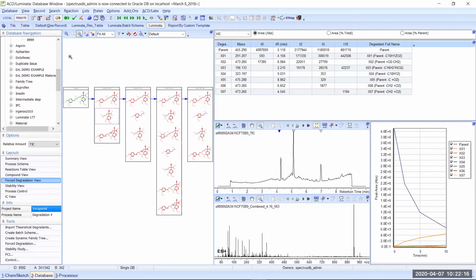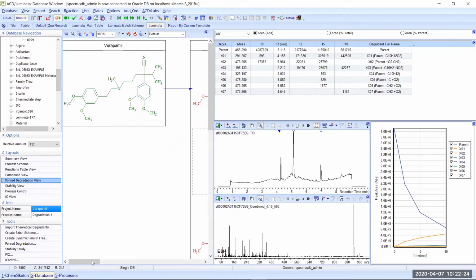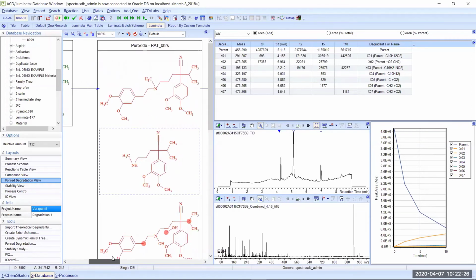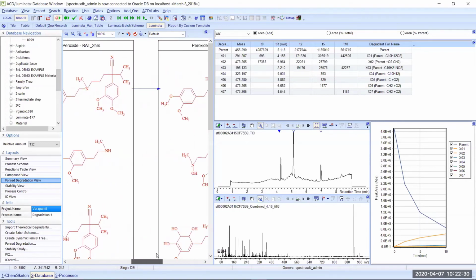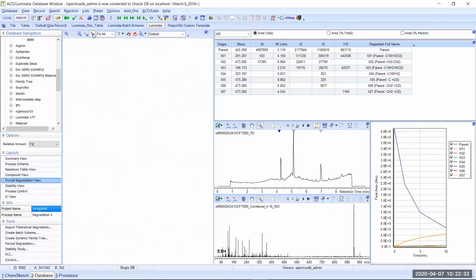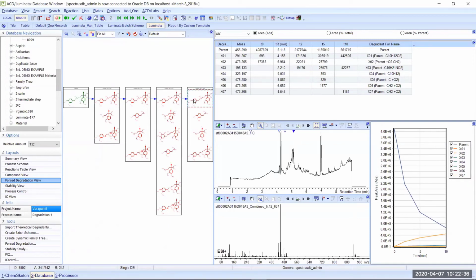And like I mentioned a little bit earlier, the top row in each case is going to be verapamil. So you'll note that if I hover down the line, you're seeing that it's the same API of interest with all possible degradants at every level, at every stage. So just getting that rough idea of what's occurring and what's being seen right now, and being able to view that and just having a targeted list.